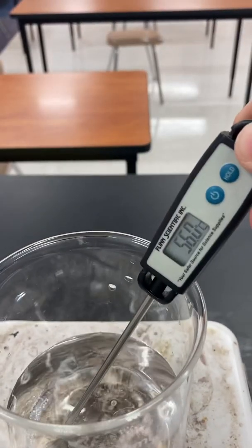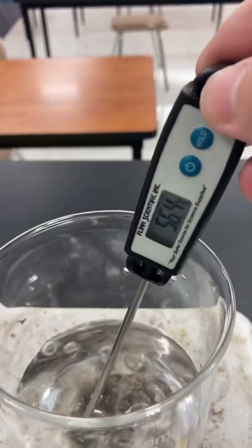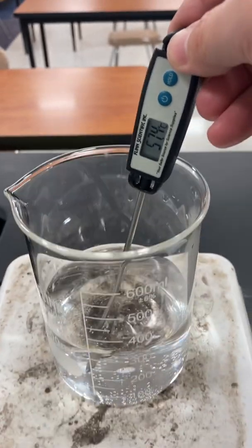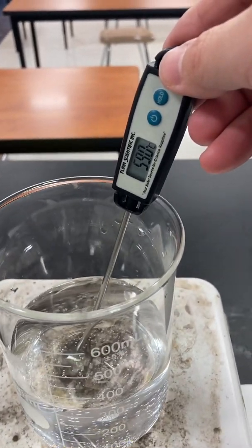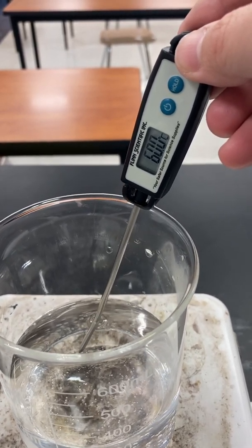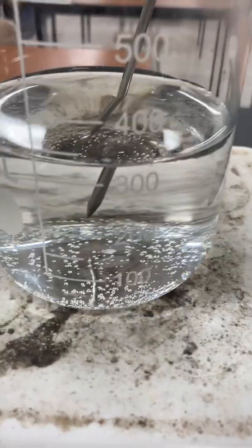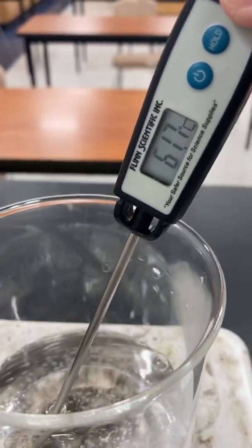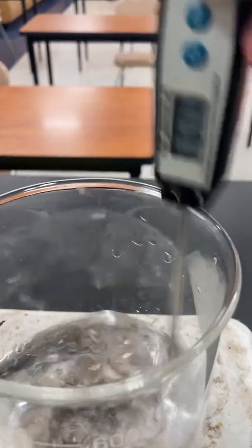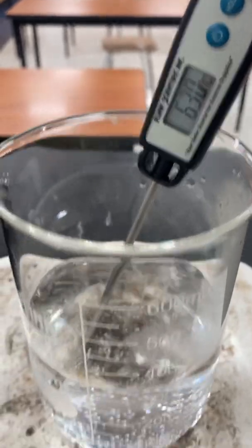Okay, at 7:30, we're at 56.0 degrees Celsius. Now, I'm starting to see some bubbles on the bottom of my beaker, but I still wouldn't say that this is boiling because the whole sample's not bubbling yet. So at 8 minutes, we got 61.7 degrees Celsius, it looks like. We're getting close.